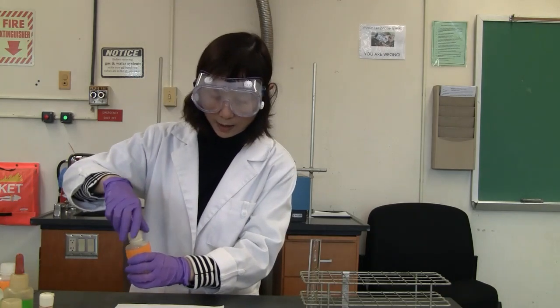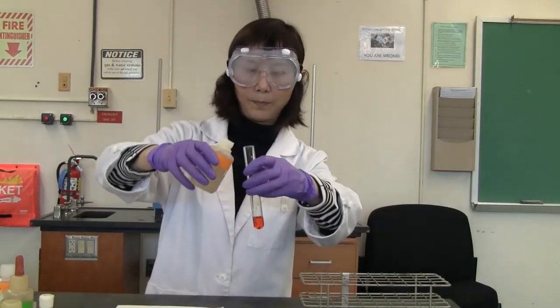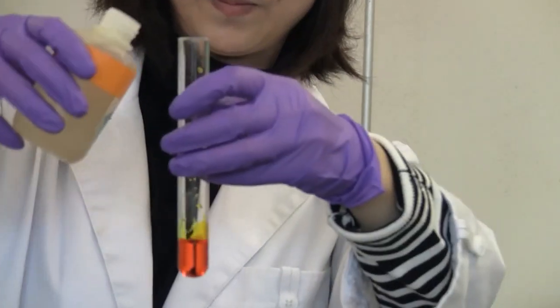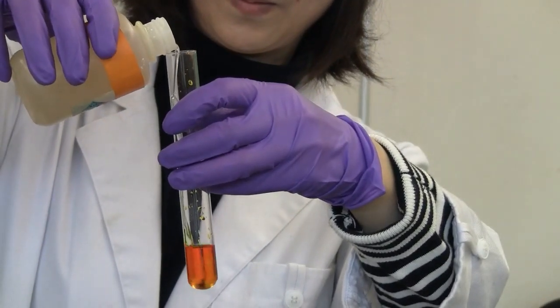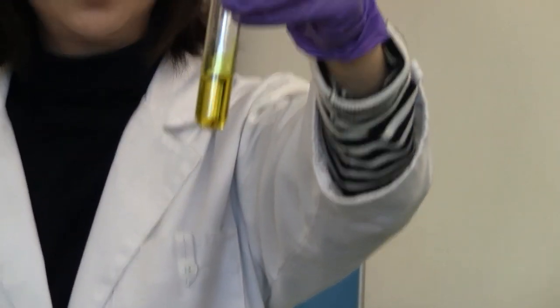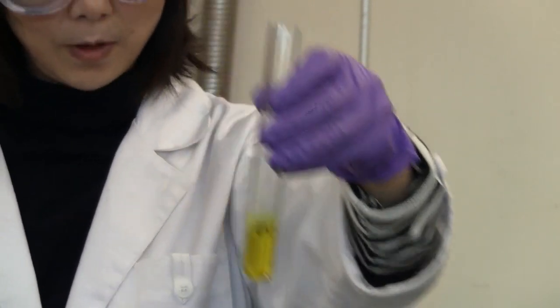I'm going to add several drops of the sodium hydroxide. You see the color change?